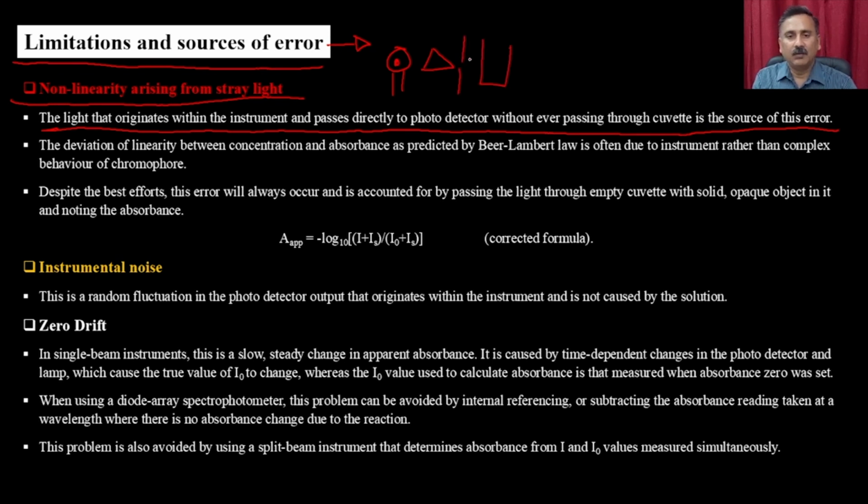If you have the solution, the light is going to enter, and there will be some rays which go directly and hit the detector.